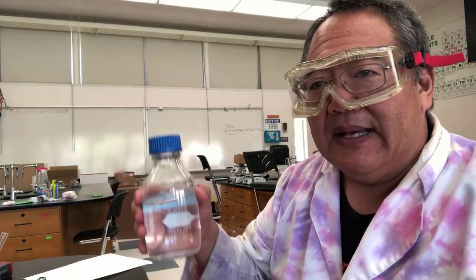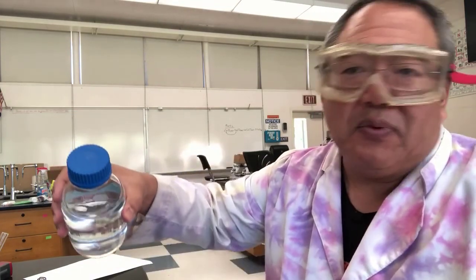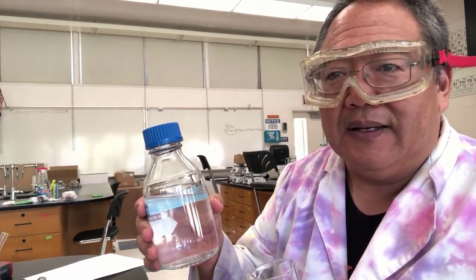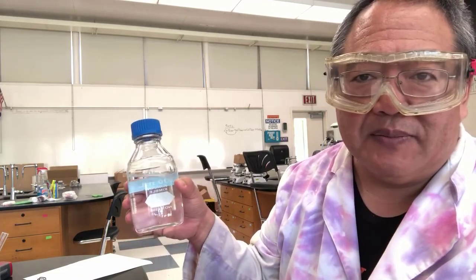When you pick up a bottle and you want to pour from it, you look at it, you double check it's what you want, you open it up, and then you always pour away from the label, and that'll avoid some contamination issues. Now, let's say I was wrong, it wasn't 150 mils that you needed, you only needed 15. You have 10 times too much. Don't put it back. If you put it back into this blue lidded bottle, you might suddenly find that you poured it in the hydrochloric acid bottle by accident and ruined the experiment for everyone, okay? In which case you have to wait around till it gets remade.